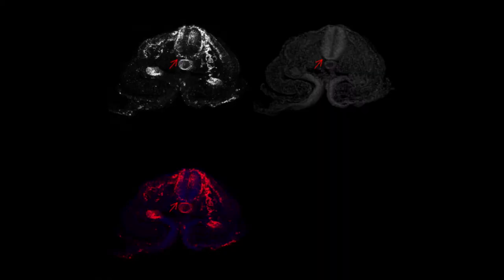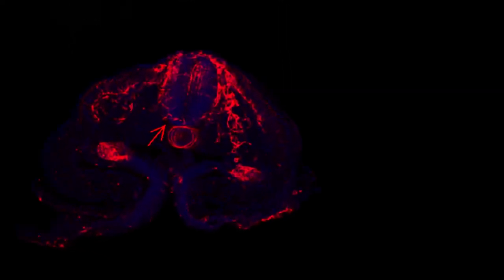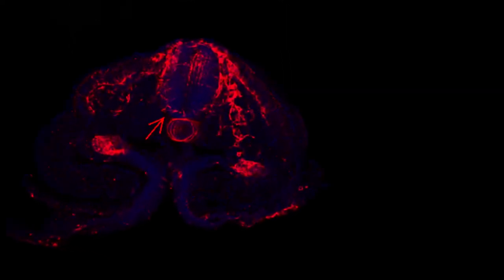This is a maximum intensity projection of a section through the trunk region of a chick embryo taken by Chris Walheim and Maria Elena de Ballard. The blue is DAPI staining. The red represents neural crest cells immunofluorescently labeled with a red fluorophore.